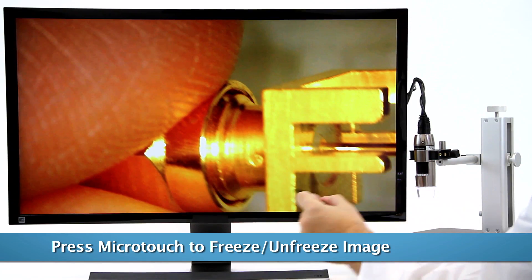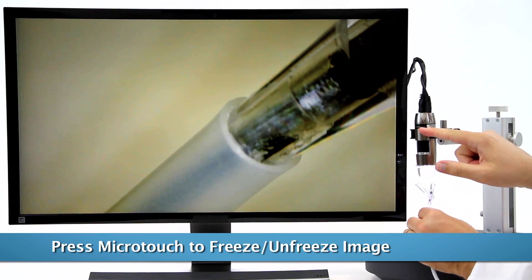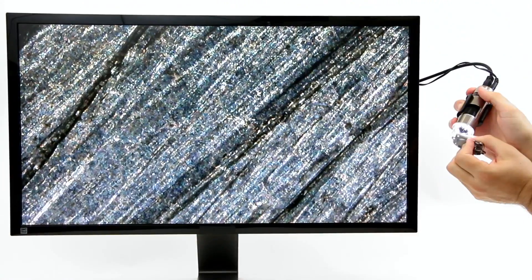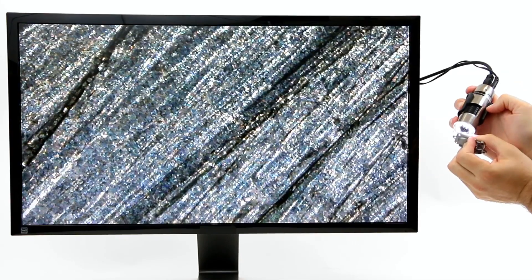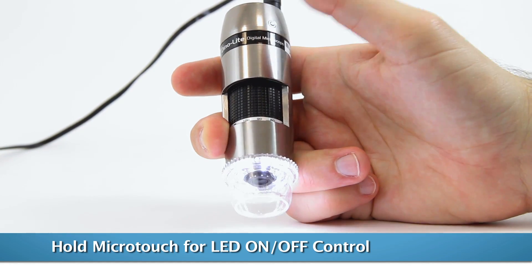The micro touch button allows you to freeze the live image with one touch to inspect fine details. Another touch will bring you back to live viewing. Pressing the micro touch button for 2 seconds will also turn the LEDs on or off.